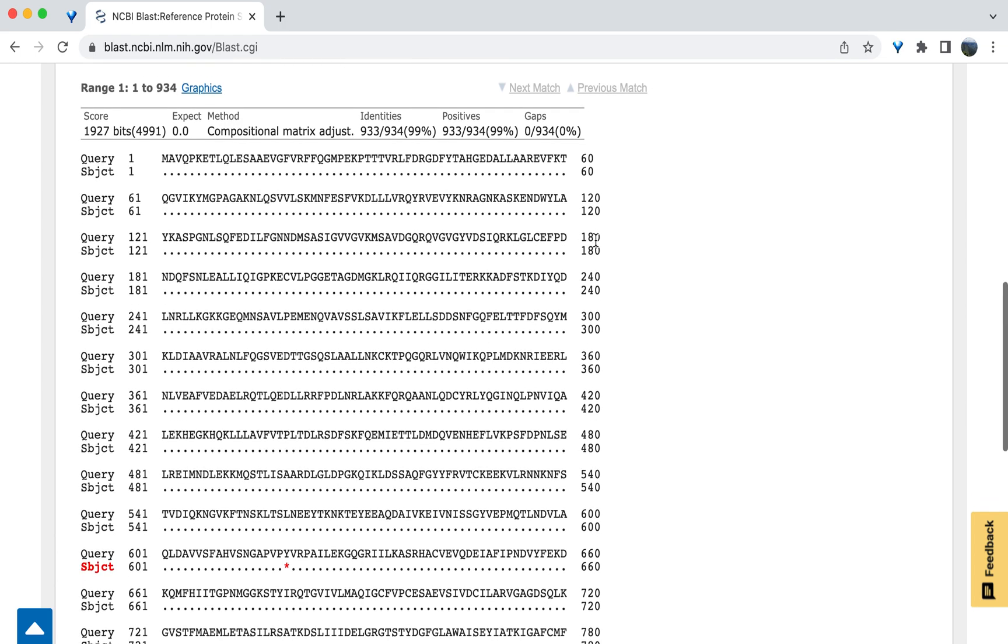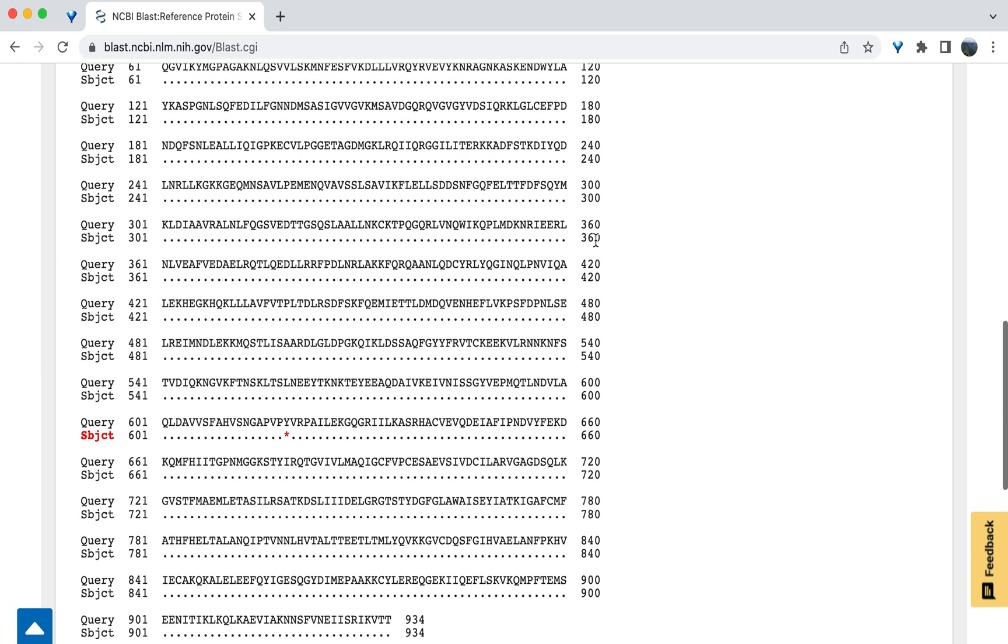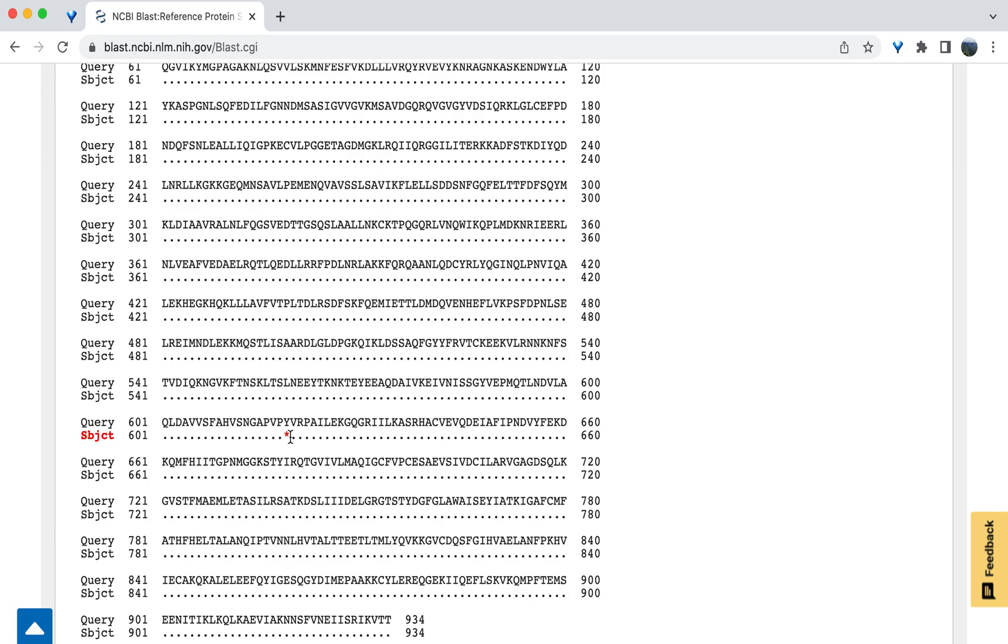Looking at the alignment, we see that the amino acid number 619, a number we can calculate from counting over from 601, is an asterisk in the subject sequence. This indicates that instead of an amino acid, there is a stop codon. In this example, the protein would be truncated at this point, as the stop codon would signal to stop translation, and the rest of the amino acids in the sequence would not be included in the final protein.